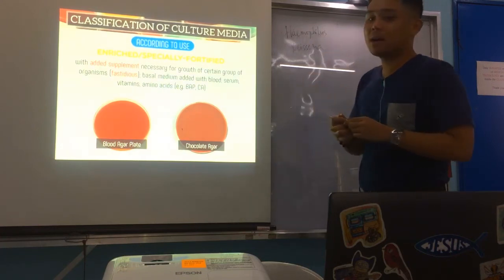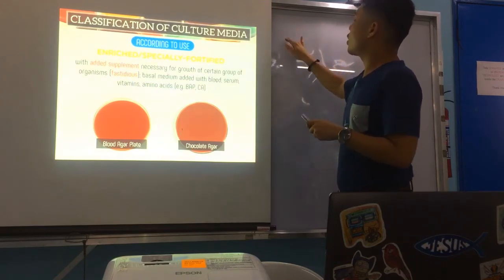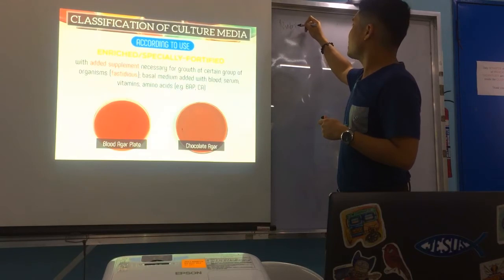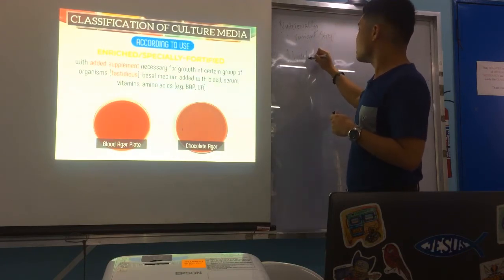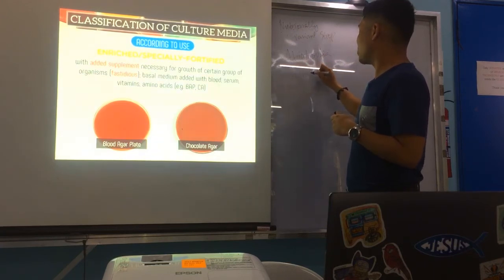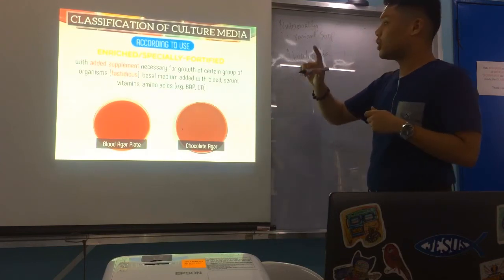They need special requirements. And we also have the Streptococcus, your nutritionally variant strep. An example is Abiotrophia and Granulicatella. Hopefully Ma'am Teddy mentioned them. Granulicatella, these are nutritionally variant.